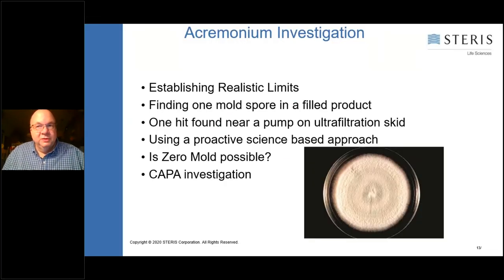Acremonium is another mold that I've been involved with recently, and this was from a facility on the West Coast. They had established very unrealistic limits for mold in the clean room. They had a limit of zero mold, which is simply not realistic. They found a mold spore on an ultrafiltration skid from this Acremonium, which, as you can see pictured here, spreads very quickly across an agar plate. So it becomes a problem when it gets in the facility because of the frequent spread that you get from it. So as a proactive, science-based approach, I told them that zero mold is really not reasonable. They really need to look at the levels of mold in the environment and look at establishing a potential limit.